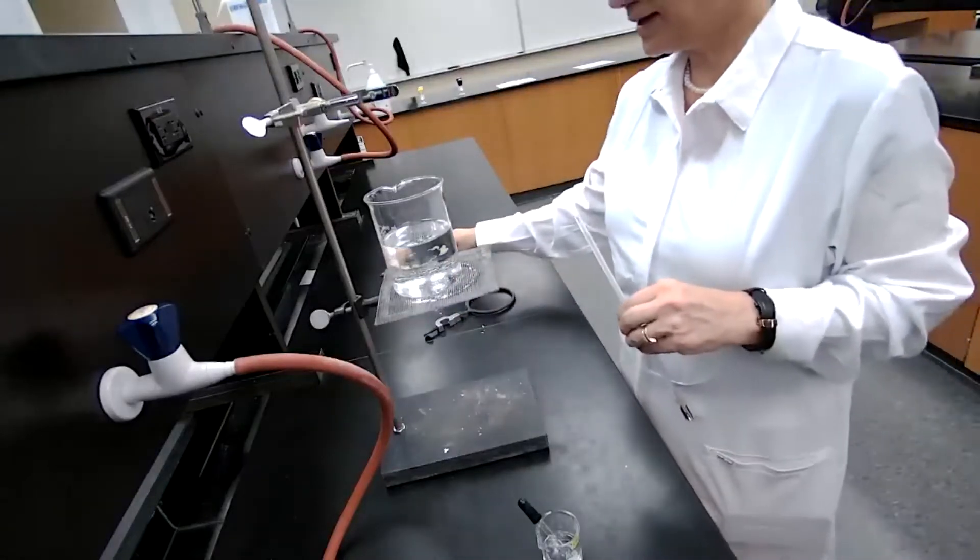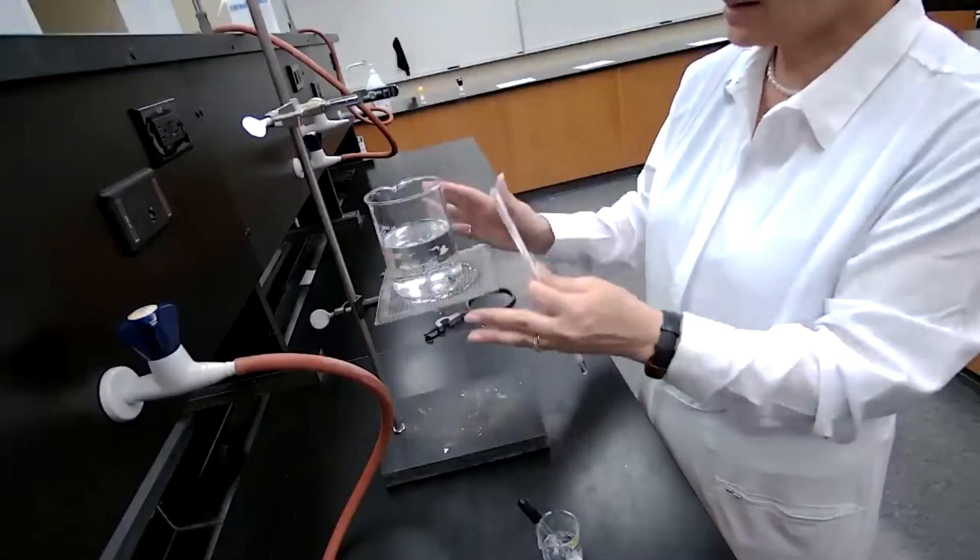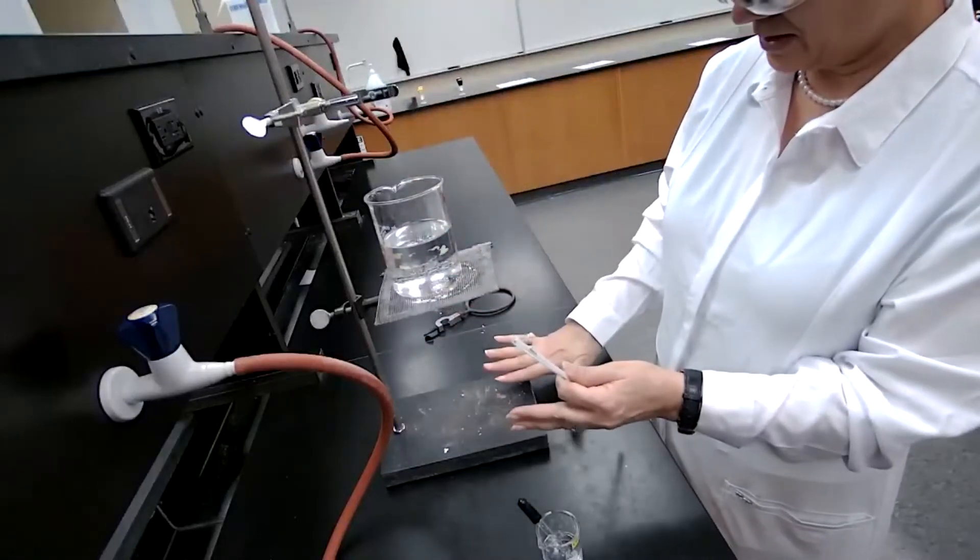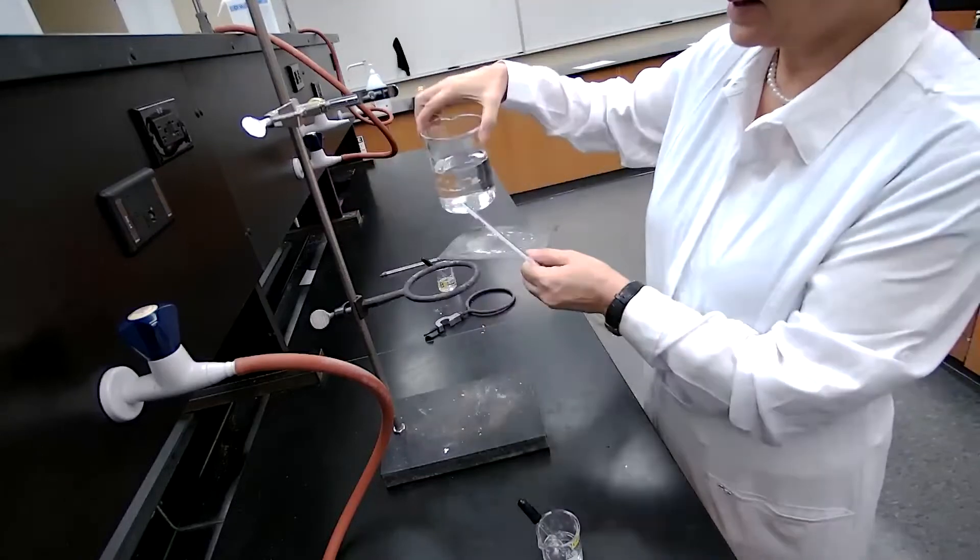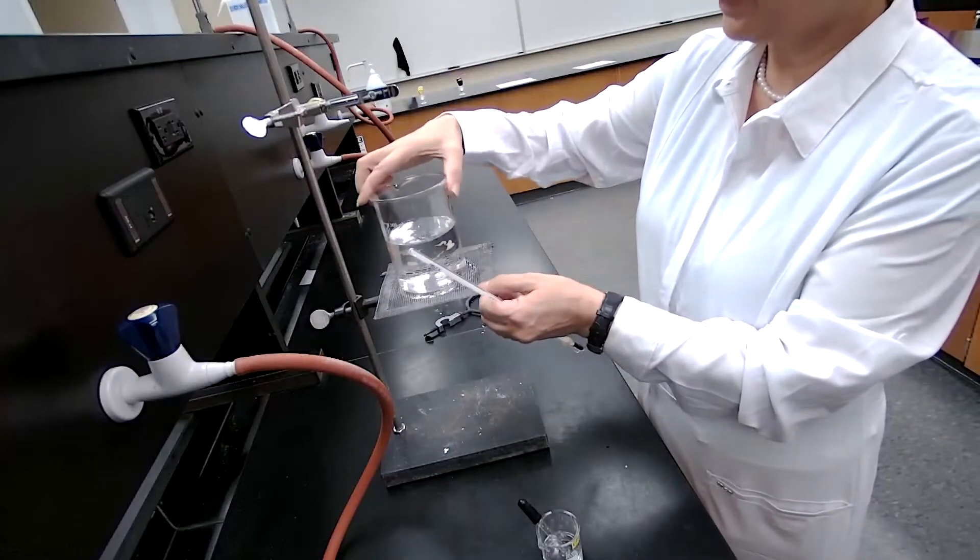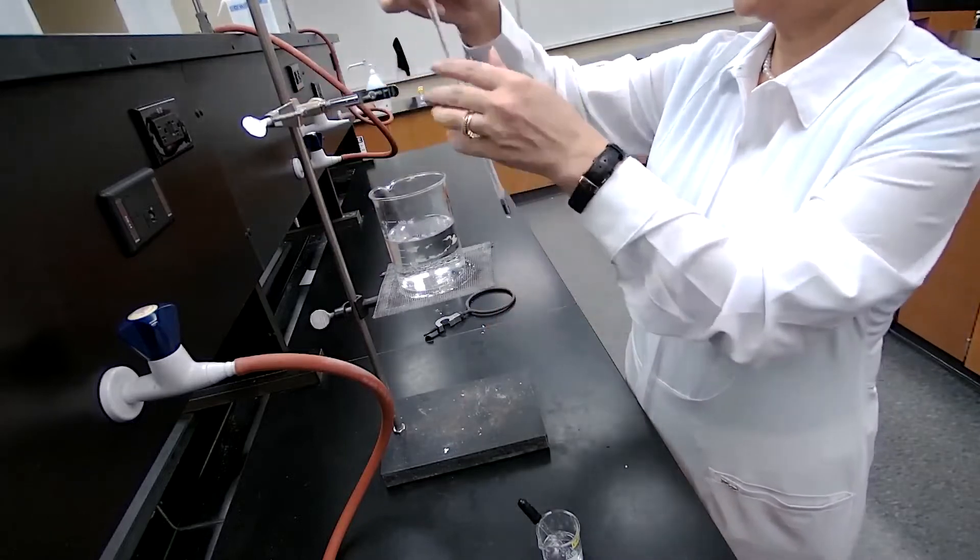To measure the boiling point, we set up the hot water bath setup. We are using the ring stand, iron ring, and a wire gauze on it. We will use a thermometer clamp to hold the thermometer.